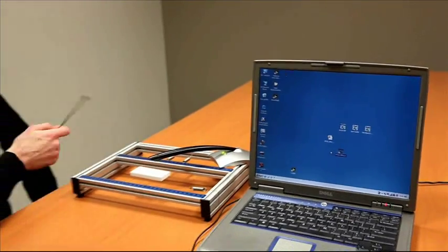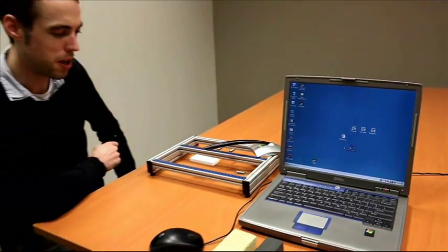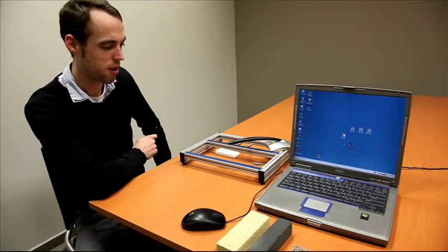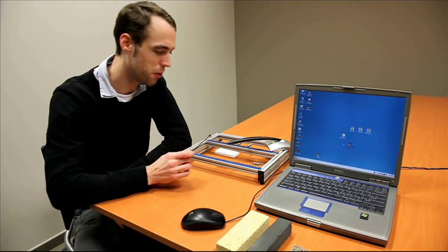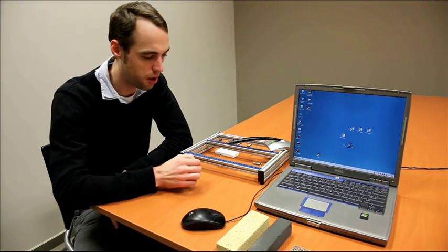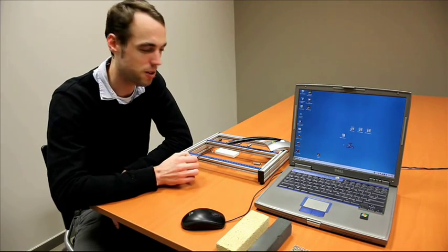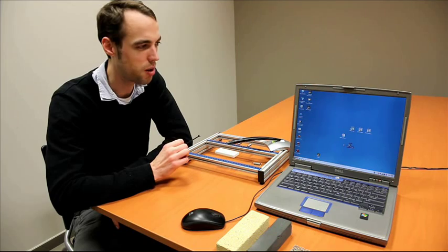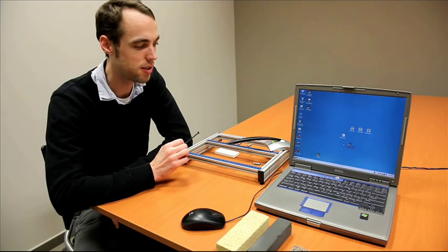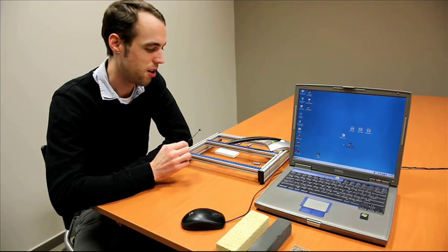Hello YouTube! Today we're going to measure elastic properties and internal friction of a rectangular sample using the RFDA basic system.